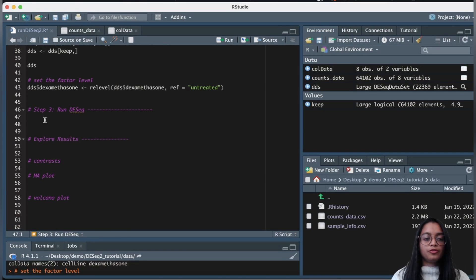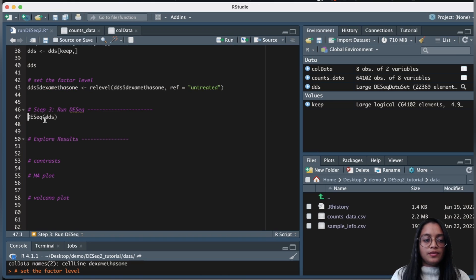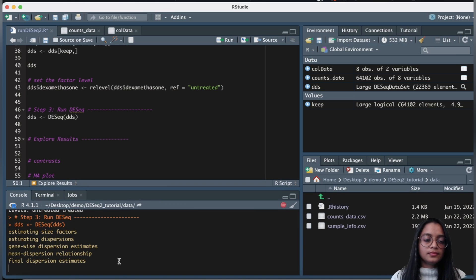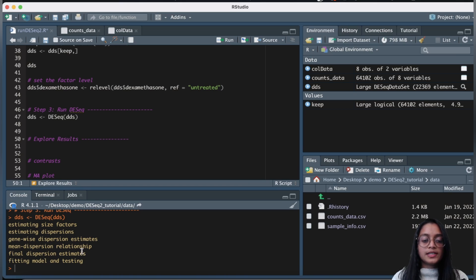Now we come to the third step: running the DESeq function on our DESeq dataset object and saving it back to the same object. We can see it is estimating size factors, estimating dispersions, working on gene-wise dispersion estimates, mean-dispersion relationship, final dispersion estimates, and fitting a model. We discussed all of these steps in my previous video, so please check that out if you want to understand what each step does.